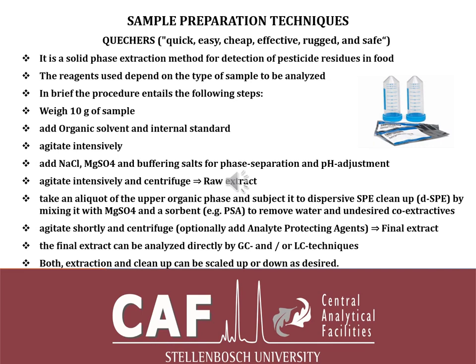liquid. You can concentrate it up to a certain level, and then you can do a lot of other sample prep from there if it has to. And when you've got that liquid, you do GC injection, you can do liquid injection.